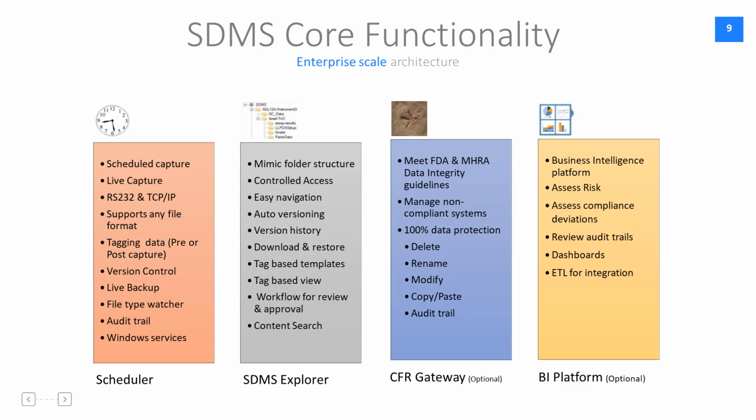And if you notice, SDMS Explorer mimics the folder structure of the original instrument software's folder structure. This is one of the core features of Logilab SDMS. You don't have to change the folder structure for storing inside the Logilab SDMS. The Logilab SDMS will mimic the original folder structure.